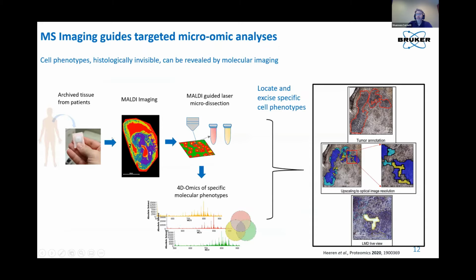And that is using the MALDI image to give us that unsupervised segmentation to tell us where a particular molecular region, a molecular phenotype of a tissue is, that we maybe want to probe a bit deeper with the LCMS approach. So this has been done in the past with histology, but as anybody that's followed imaging knows, molecularly we can define differences that histology often misses.